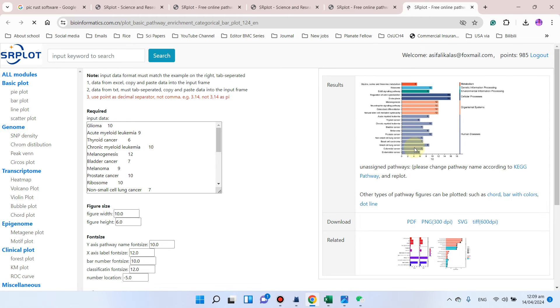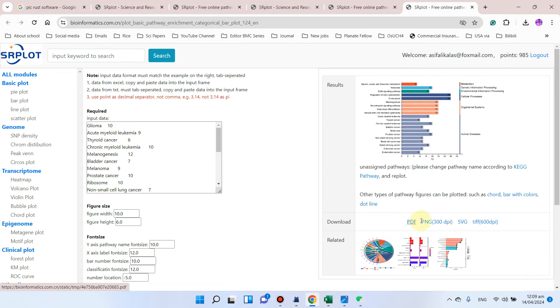Here you can see our KEGG pathway summary plot is ready. We can download it in the form of PDF, PNG, SVG, or TIFF. In this example we can download PDF.